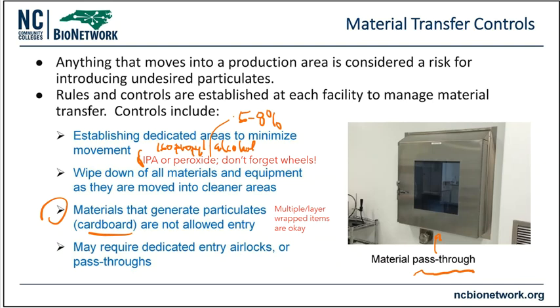These areas, I just spread germs, I just spread microorganisms. These tools or these instruments that we are using, whether it's a bottle, whatever the case might be, sometimes they are double wrapped, and if they are wrapped in multiple layers, the nice thing about this is that on the inside they could be very sterile. And then as they venture closer and closer into the aseptic areas, we can actually take the outer layer packaging off, and that will expose this new layer underneath that has not come in contact with microorganisms or any type of particulates as we have traveled and progressed throughout the facility.